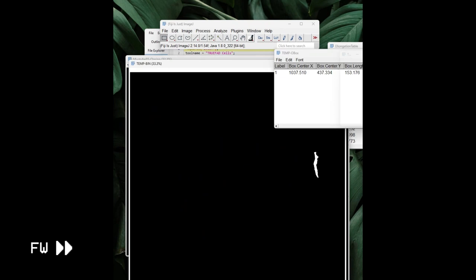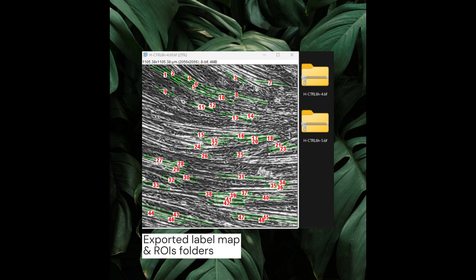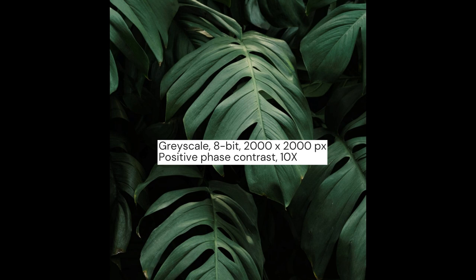Please note that Trufad Cells is designed for square images only. Therefore, as mentioned earlier, all input images will be automatically cropped to square shape before being processed, while the remaining part of the images will be disregarded. We recommend using grayscale 8-bit images captured with phase contrast and 10x magnification, with a resolution of approximately 2,000 by 2,000 pixels. We'll discuss how to interpret the exported results in a following section. But for now, let's move on to the Trufad Histo workflow.